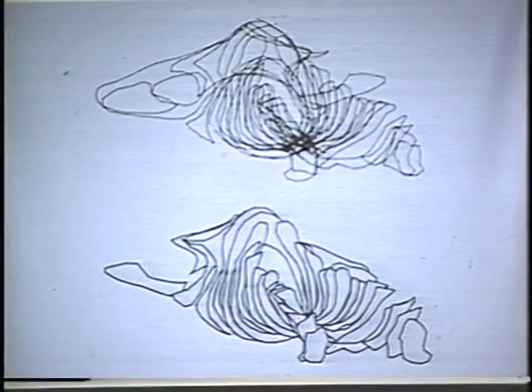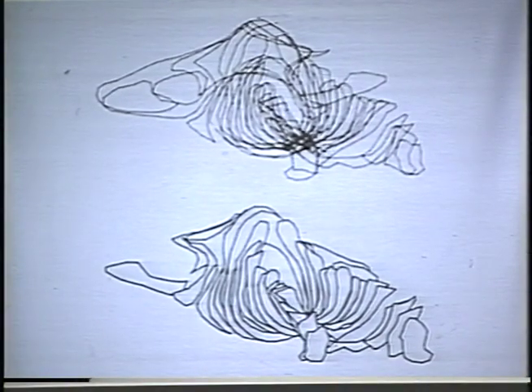Well, there are different kinds of 3D reconstructions. The one type is a reconstruction in which you can see all of the lines associated with all of the contours. So there is no hidden line processing at all. Here's the same reconstruction with hidden line processing, such that if the structure in the foreground is covering up structures in back of it, you cannot see the contours of the structures lying in back of it. So it gives it more of a solid appearance.